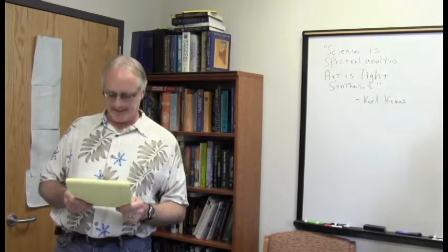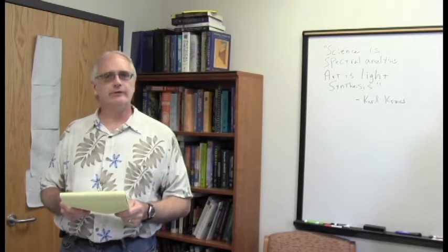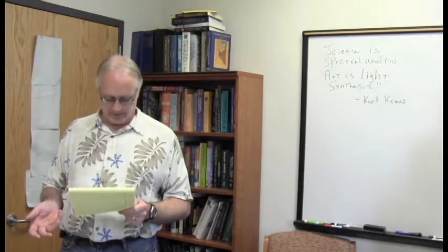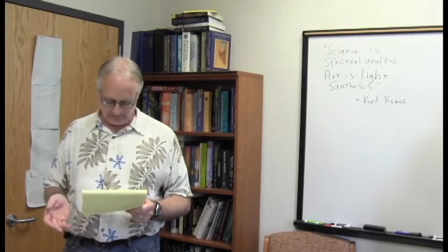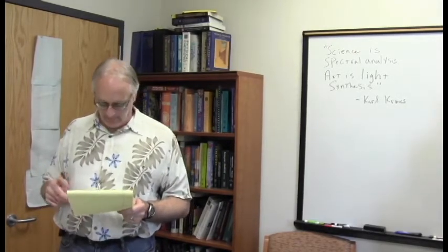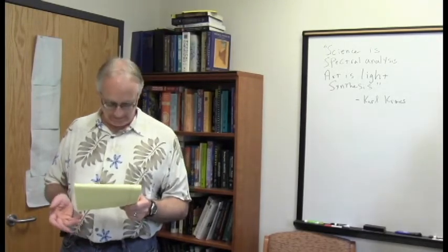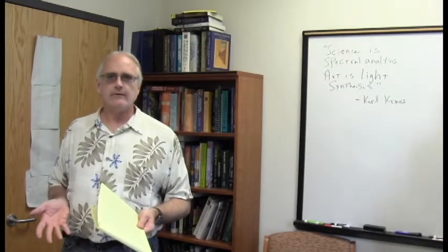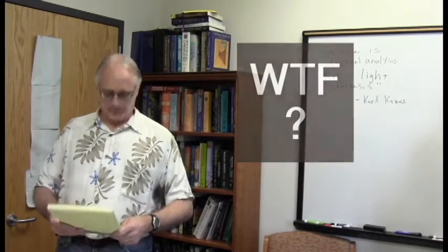But that got me to thinking, shouldn't normal hydrogen split carbon too? If a carbon with one hydrogen on it, shouldn't it be split into a doublet by the two hydrogen spin states? Shouldn't a carbon with two hydrogens on it be a triplet? Every carbon spectrum you've ever given us shows us the carbons looking like singlets. So what's going on? Are you lying to us? WTF? Signed, another student. Oh, and P.S. Love the shirts."